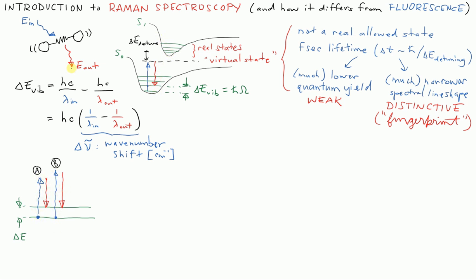So that tunability is an important thing. You have tunable excitation. You can use whatever wavelength you want within some bounds, but conceptually here, you're free to use different excitation wavelengths for whatever's more convenient for you, and you will get information about Raman scattering that's the same.